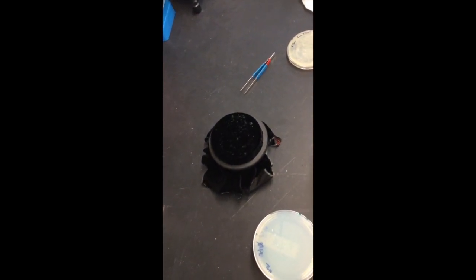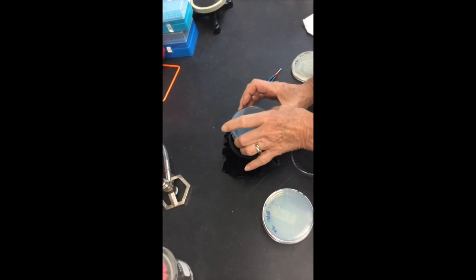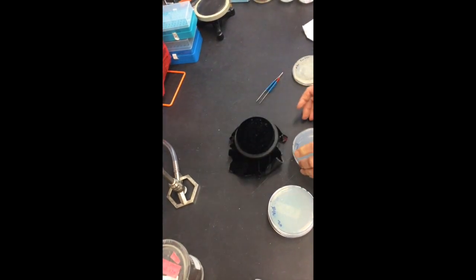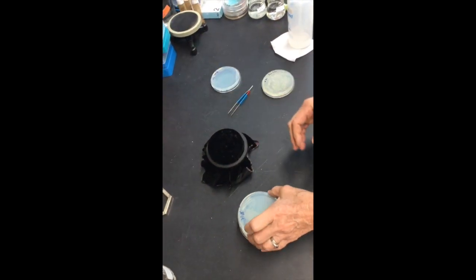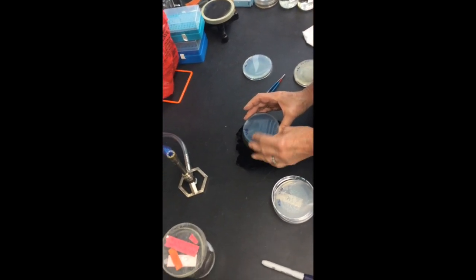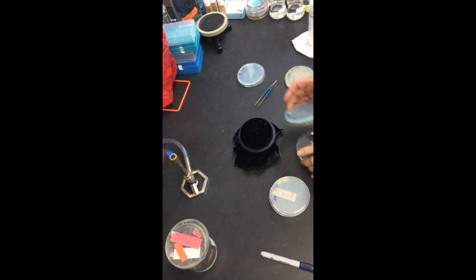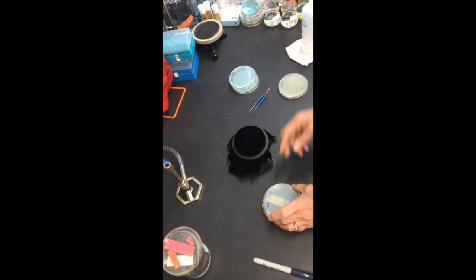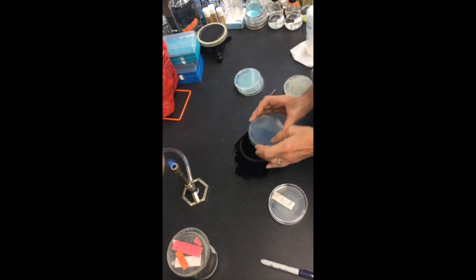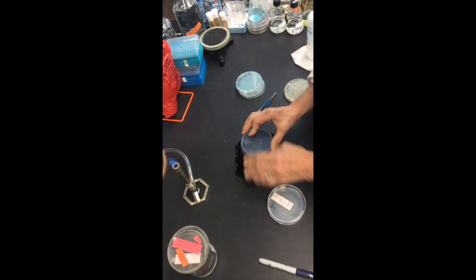So now we're going to take one of the plates, and I'm simply going to line up that mark with this, press it down and up, and it's going to pick up enough cells so that they will grow and the colonies will be identical in distribution to what was on my original plate. And we can do several little Xeroxes with this, with my high-tech Xerox machine.